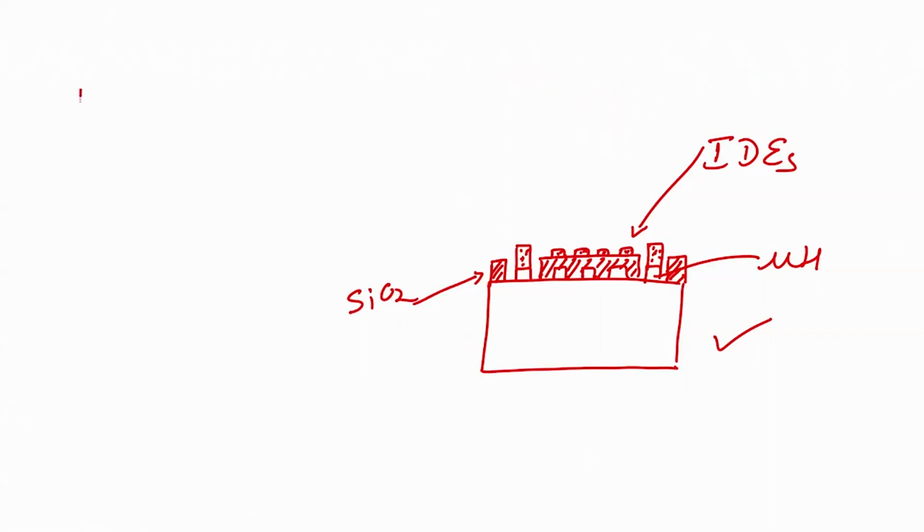Now, we want to create a channel in PDMS. What will I do?